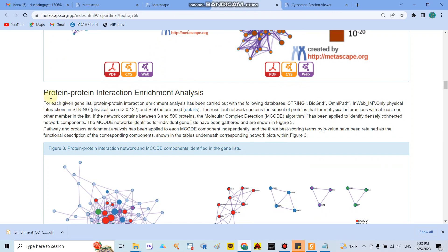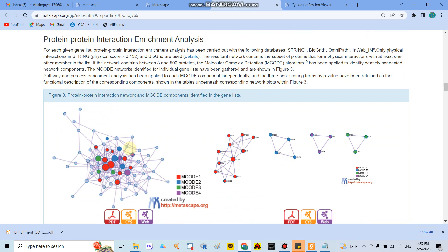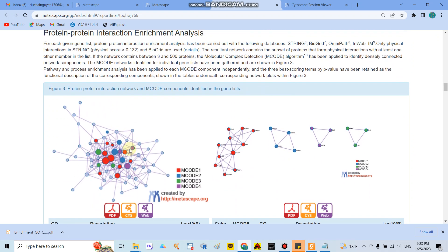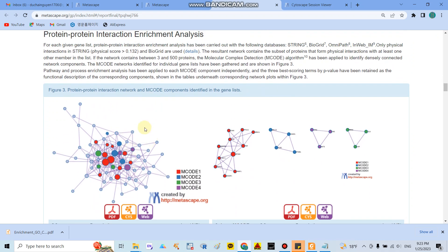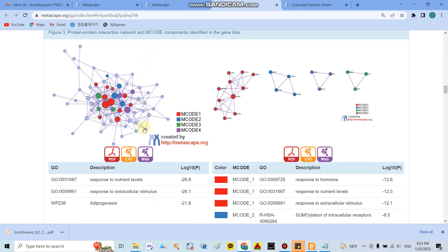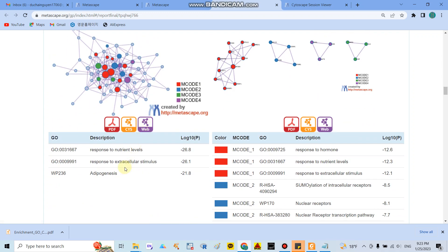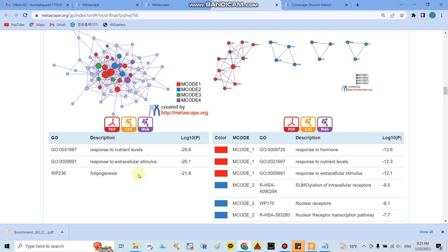Go back to the data again here, a very important one is the protein protein interaction enrichment. In here they will show you how is the protein protein interaction among the genes you input in this website. And here they have around three protein protein interaction pathways related to the genes in this case. Response to nutrient levels, respond to extracellular stimuli and adipogenesis related to the etiology of obesity.